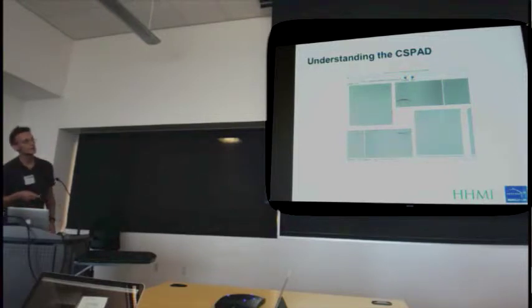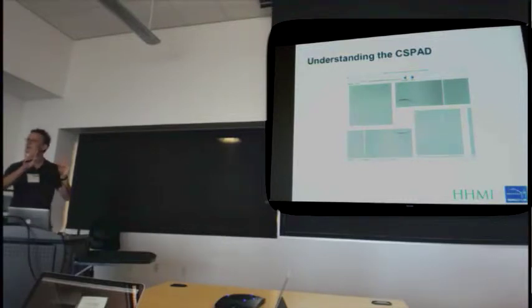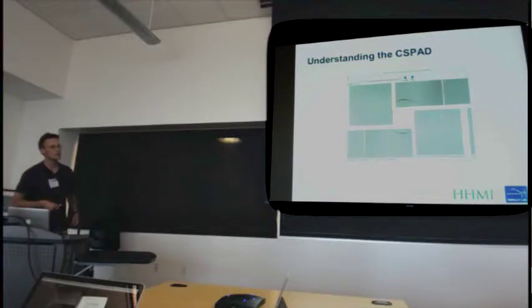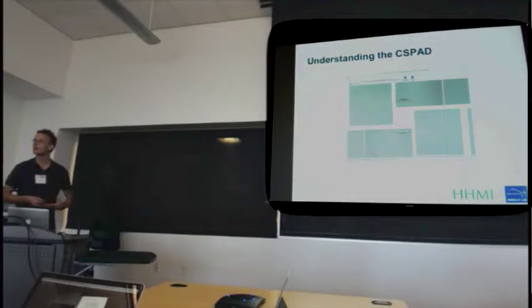And it turns out that it wasn't, because that initial arrangement of all these sensor elements wasn't precisely correct. I think in hindsight it's fair to say that we didn't realize at the time that this metrology problem, as we now call it, would sink so much time, and we didn't appreciate the importance this would have for the processing further on.